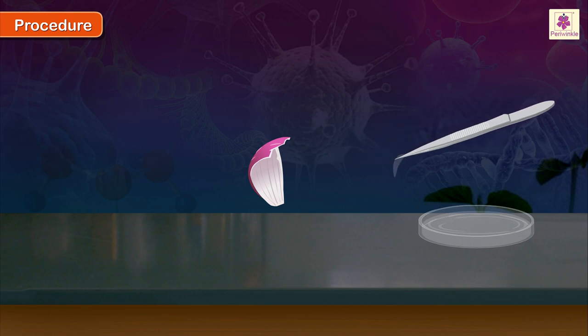Immediately transfer the peel to distilled water kept in a clean petri dish.